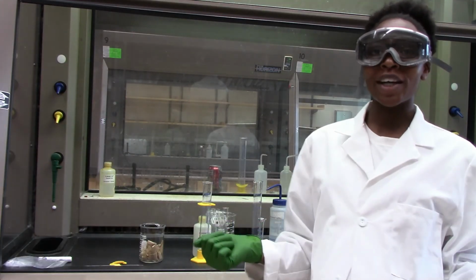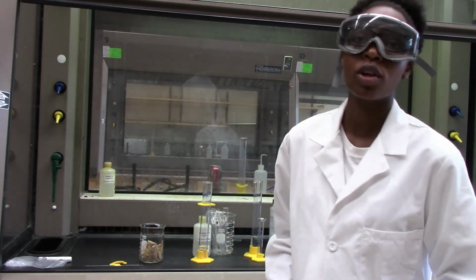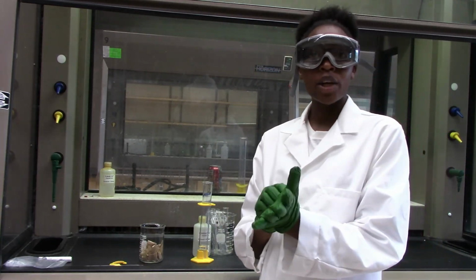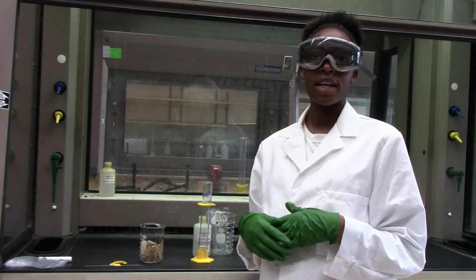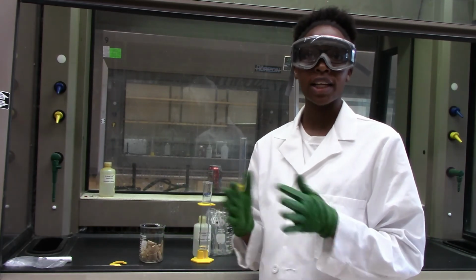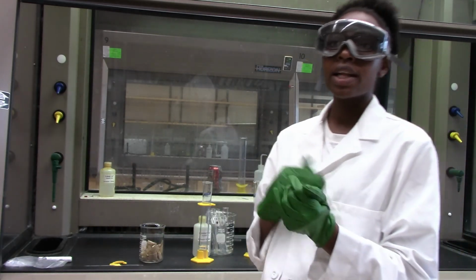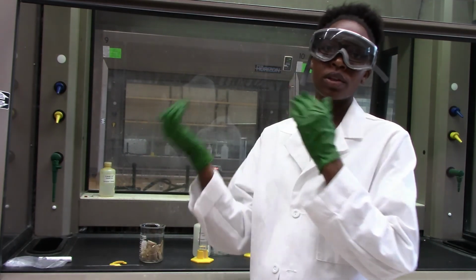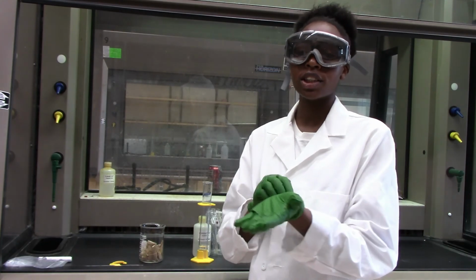Hello everyone! So today we are going to do an experiment that involves obtaining the equilibrium constant. When we have our reactants, we expect them to form products, and at some point, once equilibrium has been established, some of our products will reform the reactants and we will have that constant reestablished.